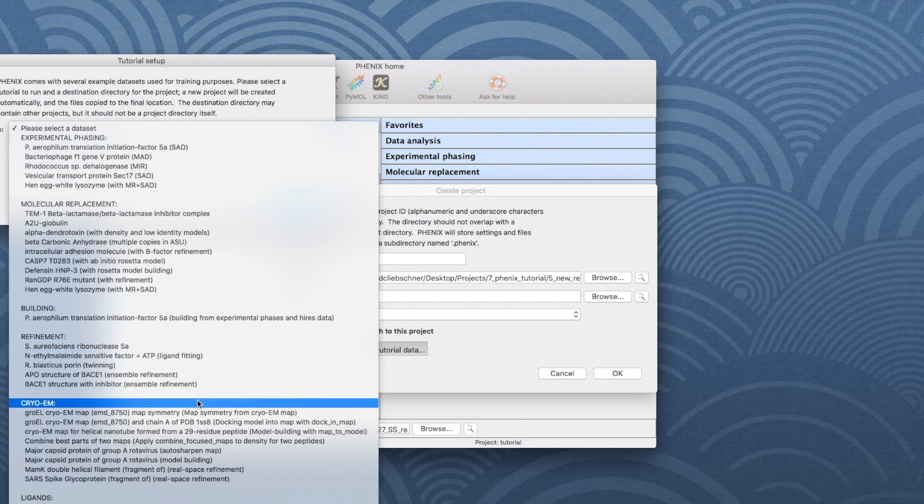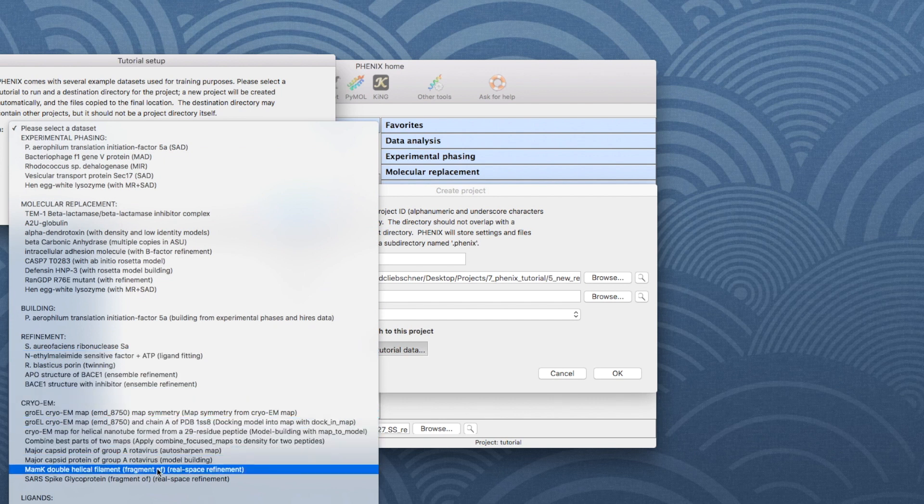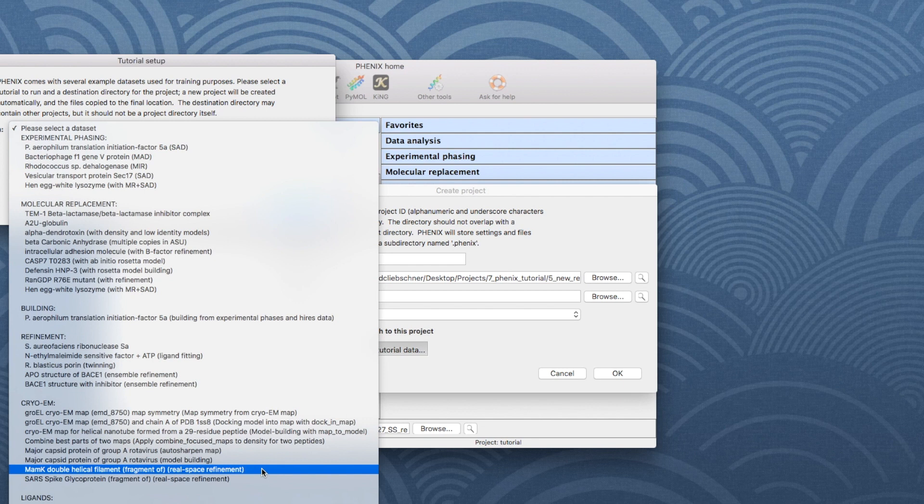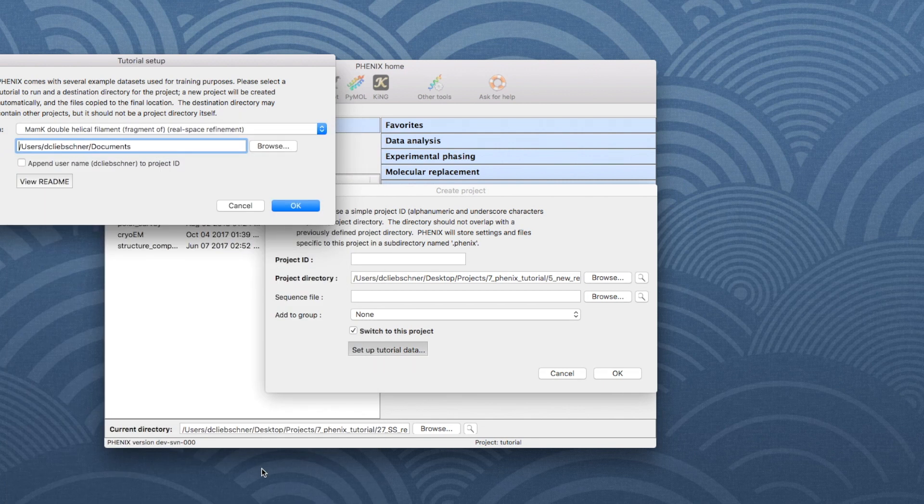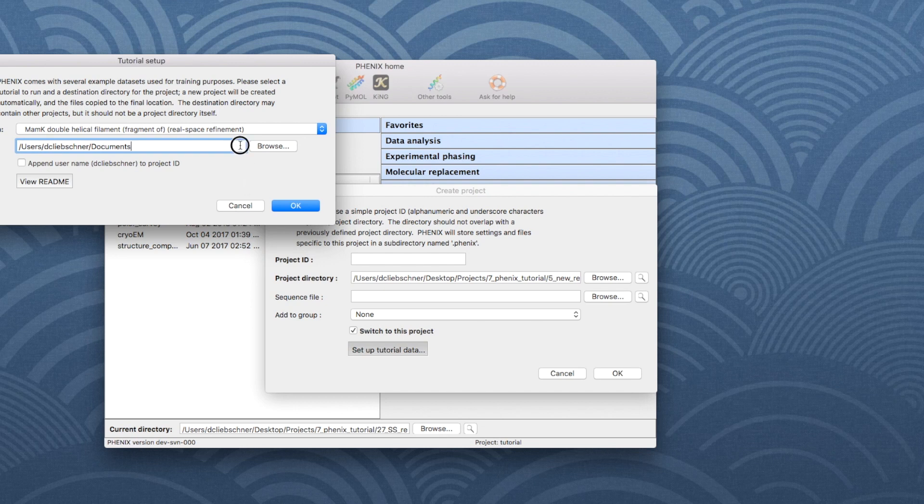Go down to CryoEM and choose the second-to-last dataset, called MEMK double helical filament. The README file gives some information about the tutorial. Choose a target directory and then click OK.